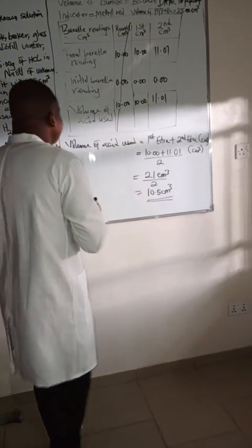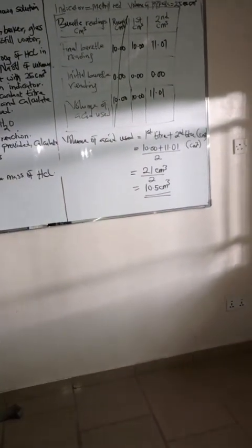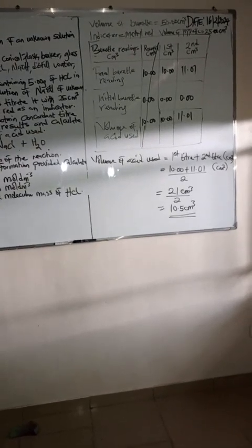This is now our volume of acid used. They said calculate the volume of acid used.